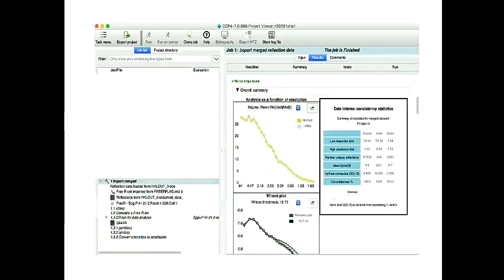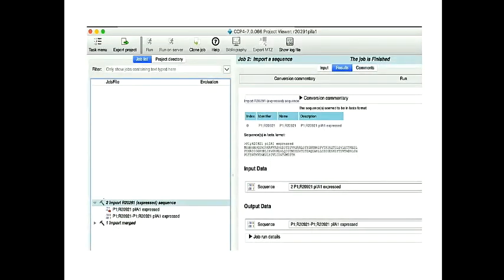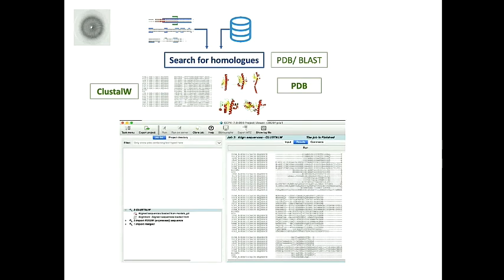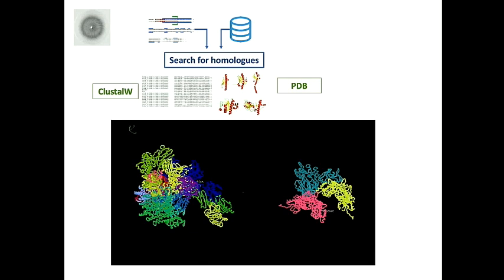Because this is a CCP4 study weekend, I'm going to focus the rest of the practical side of the talk on how do you do it in CCP4i2, which was also relatively new to me, because I've been doing this for a while and I use CCP4i1 a lot. The first thing you need to do is get your data, get your sequence into i2. In our case, what you would normally have is you would have started with a multiple sequence alignment, and from that you would recover your PDBs. We did it the other way around, so we had the PDBs because we did a keyword search. We took the sequence from those PDBs and used ClustalW within i2 to get our multiple sequence alignment.